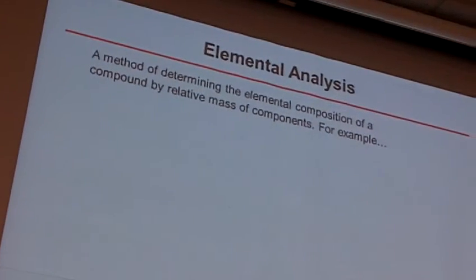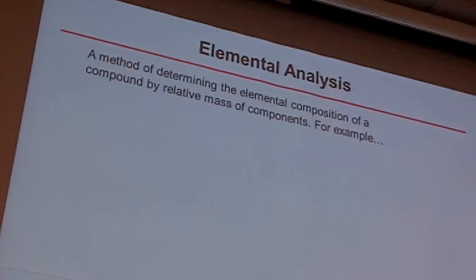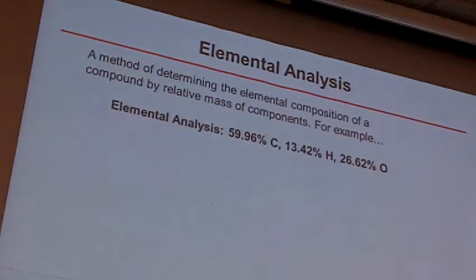What the elemental analysis of your compound is, is basically just a breakdown of what elements are in that compound, and in what percentage by weight. They have methods of doing this where you can figure out a certain amount of hydrogens, carbons, oxygens, nitrogens, chlorines, etc. that are in your molecule, in your unknown. So you're going to get something like this.